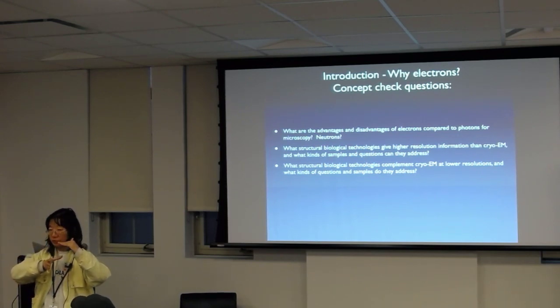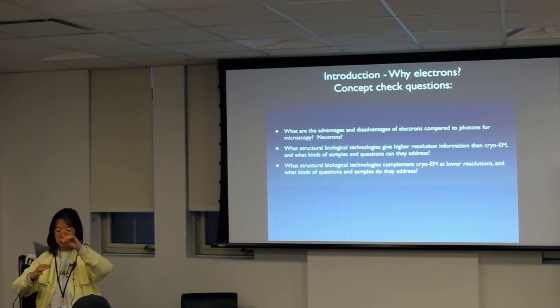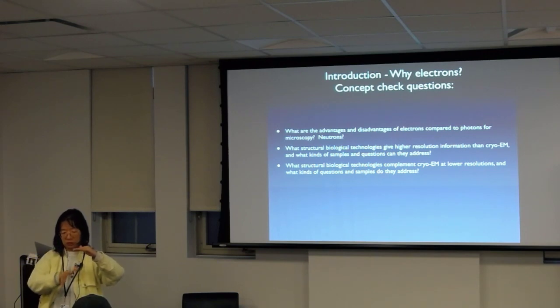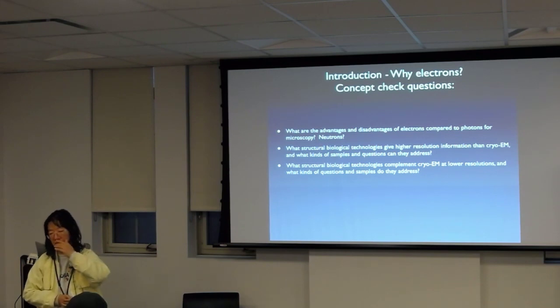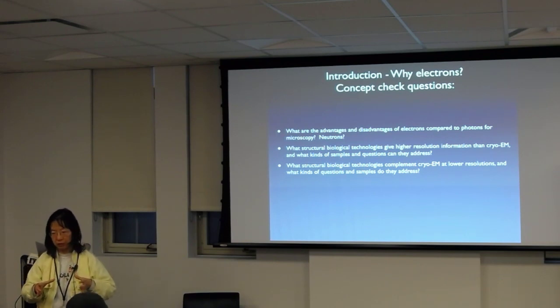You could do it both ways. Since my objective lens is going to focus at one point at any time, I could move my stage there to get the focus, or if my stage is here, I could move the objective lens there to focus. This is why you have to first get your stage right, and do both of these, before you align. This way, the point that you are focused on for your objective lens is the same point as when they created the microscope.